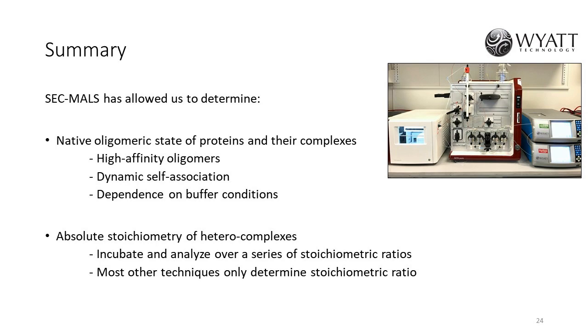Also, sometimes the histone proteins are very polar and they tend to stick to the column. So that's probably why it also didn't elute. And even if they did, the light scattering would be really tiny because they're small proteins.